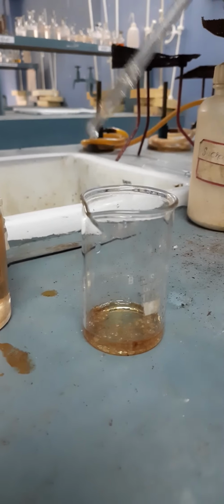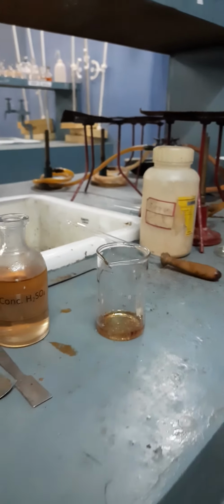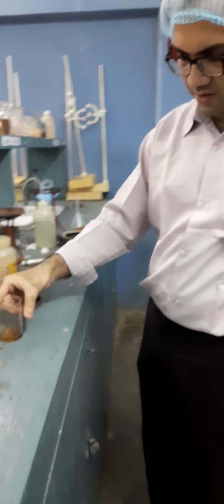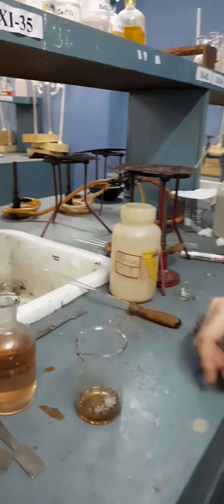We have added the concentrated sulfuric acid, and the reaction has started. You can see it is turning black. Slowly it is turning black. You can check it out.